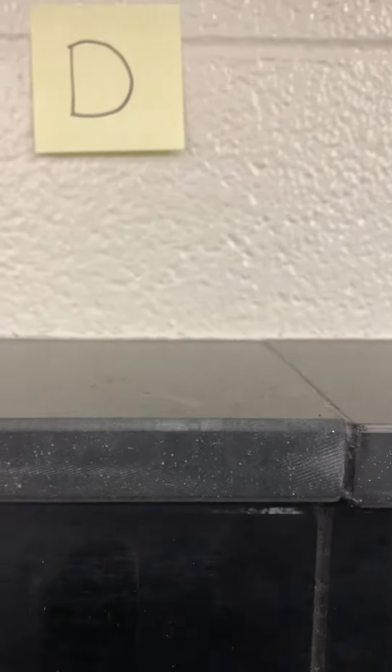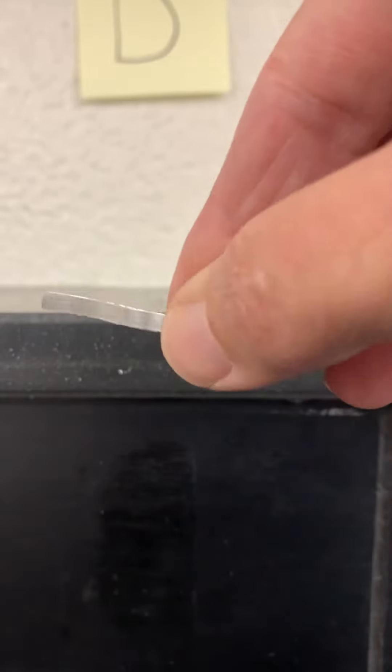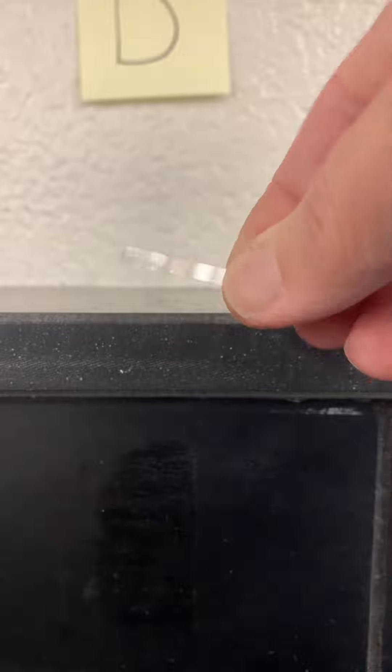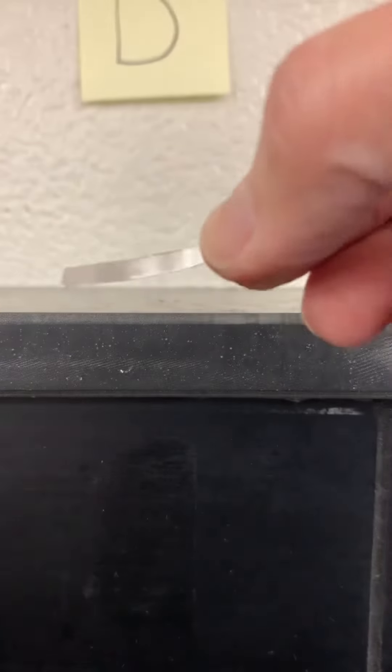This is investigation D. Investigation D involves some magnesium ribbon I have here. You can see the color, what it looks like. You can see it bends very easily. It's kind of a flat form right now.